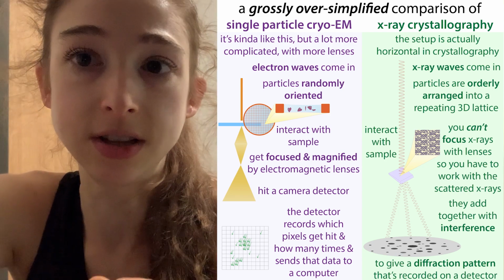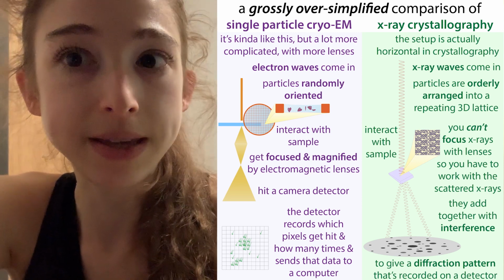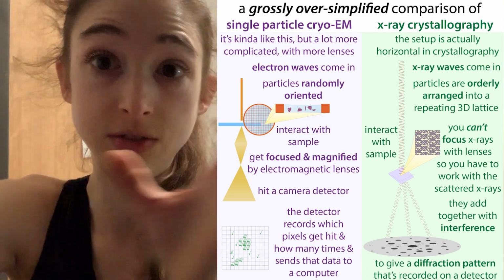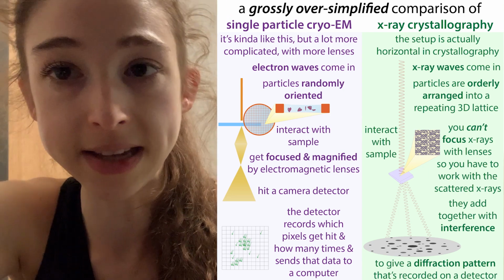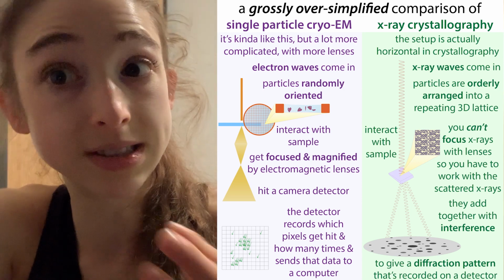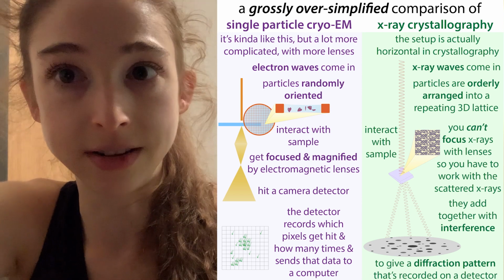Whereas with X-ray crystallography, it's harder to get the structures of complexes, because if one protein doesn't like to sit still, now imagine 5 of them trying to sit still together in the same orientation and all these different things. So it can be really, really hard to solve a complex with crystallography, although it can also be hard to solve with cryo-EM. But with crystallography, it's typically a lot harder.